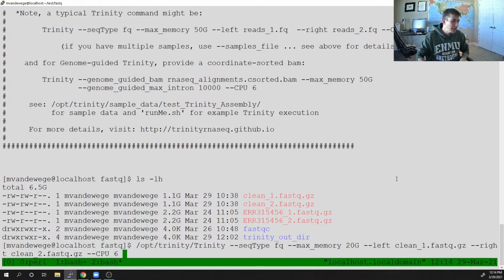Since we have multiple people using this server at once, recognizing other classmates are running jobs, if all of us are doing this at the same time, we get maxed out at 140 gigs and 42 processors, which is about maxing that machine out. So this is definitely something we should be aware of. Don't go above 6 processors, because you don't know who else is running something.